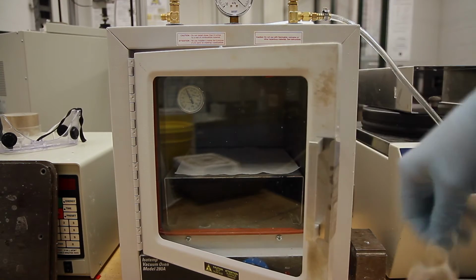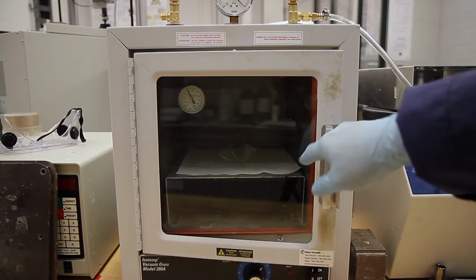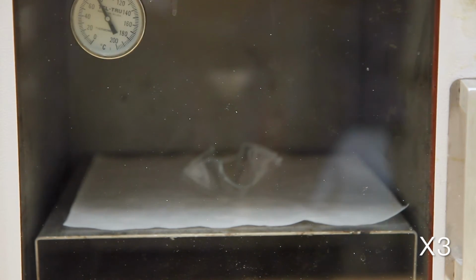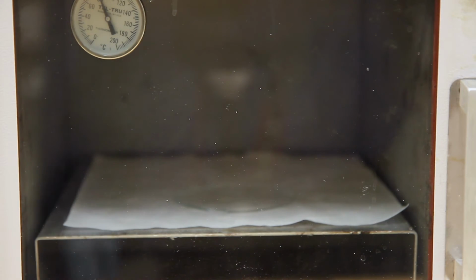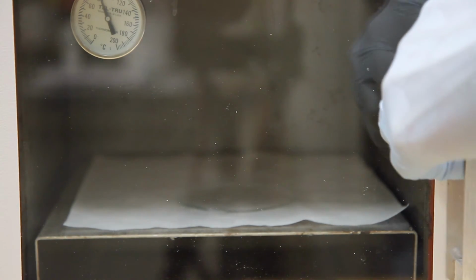Now I'll put this back into the oven. We should observe this sample returning to the permanent shape that was demonstrated in the beginning of the video. If you look closely in the oven, the sample is now returning to the permanent shape. This is fast-forwarded by 3 times, and the real time of this event took about 30 seconds. Okay, now it is back to its permanent state. Therefore, it is flat. I'll pull out the sample.